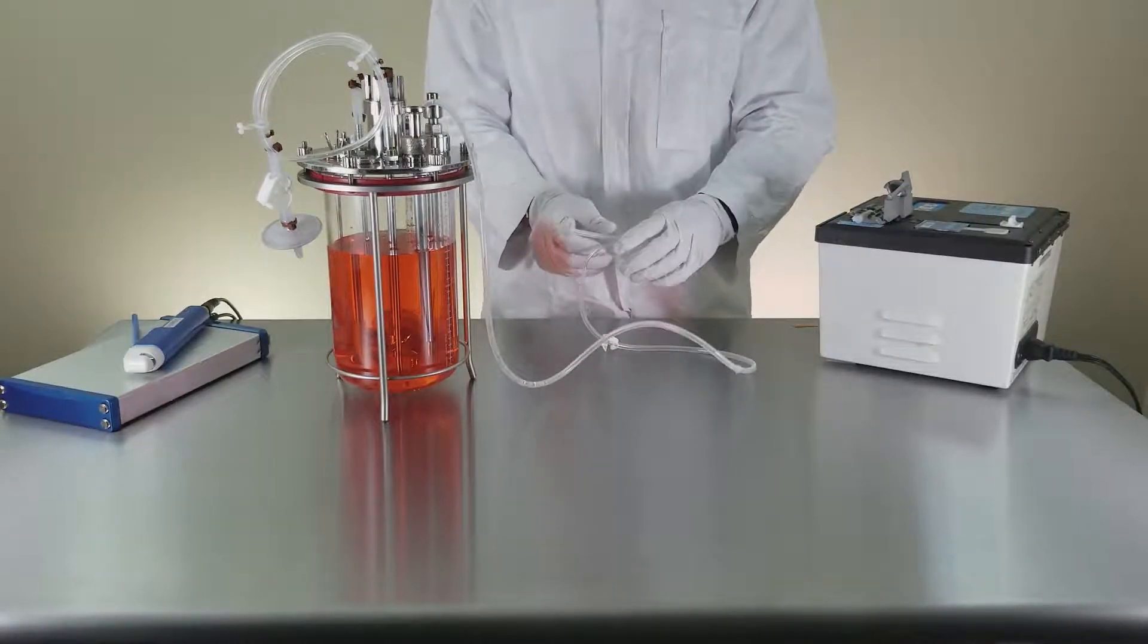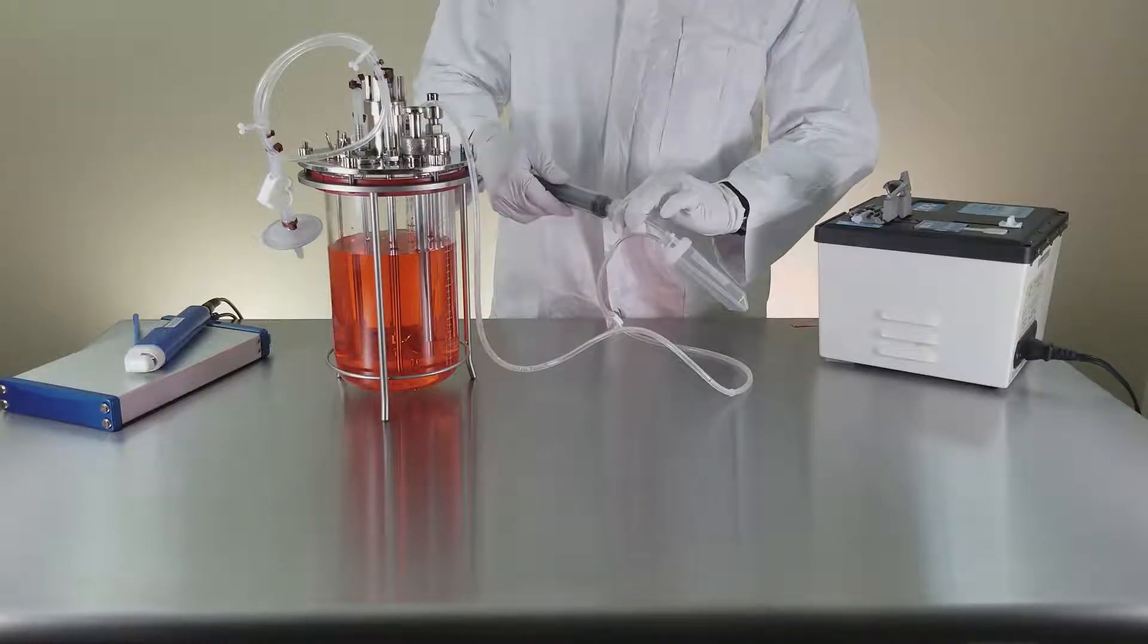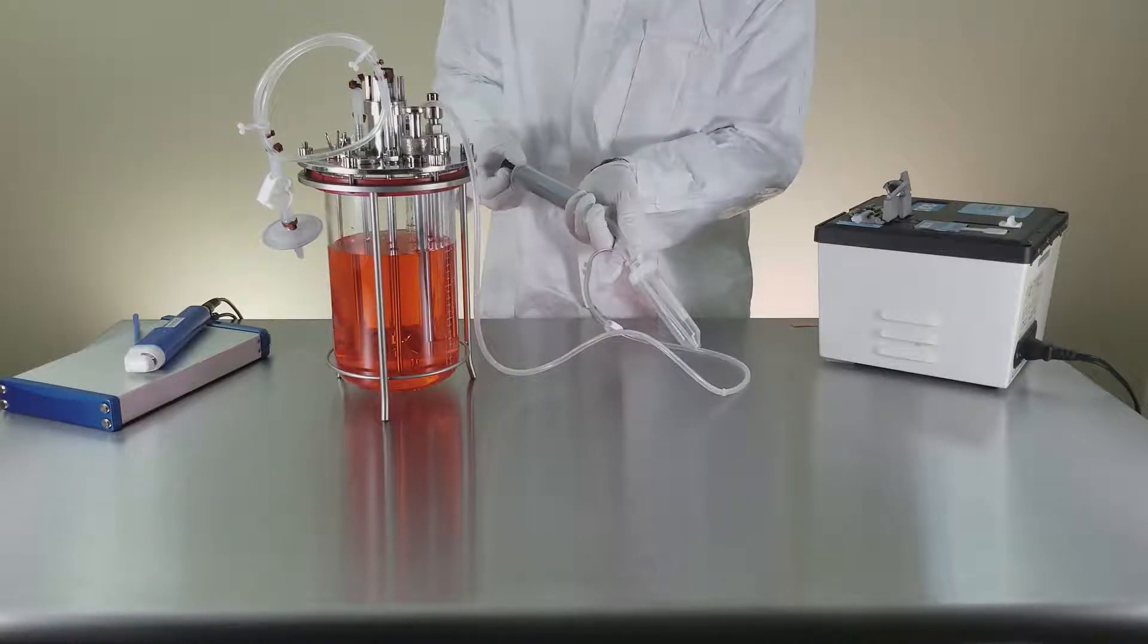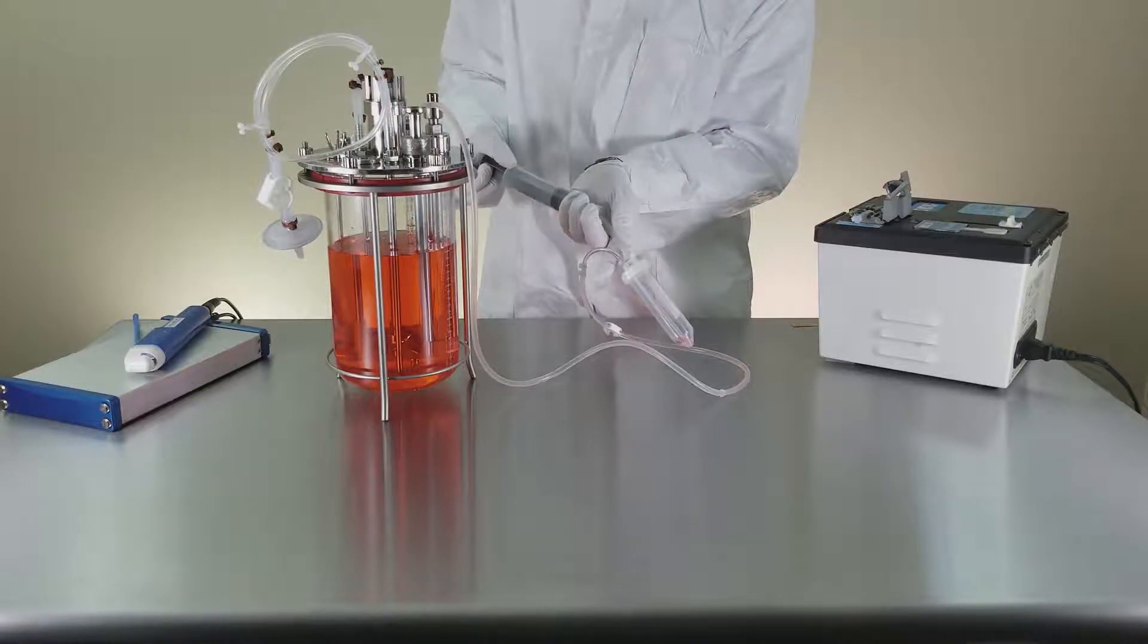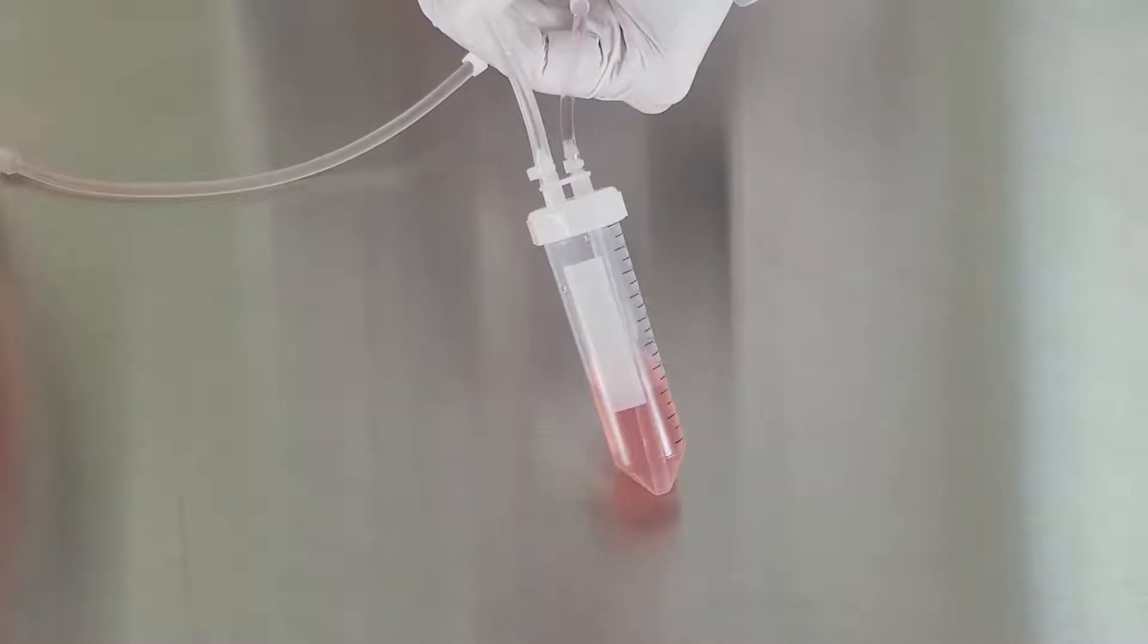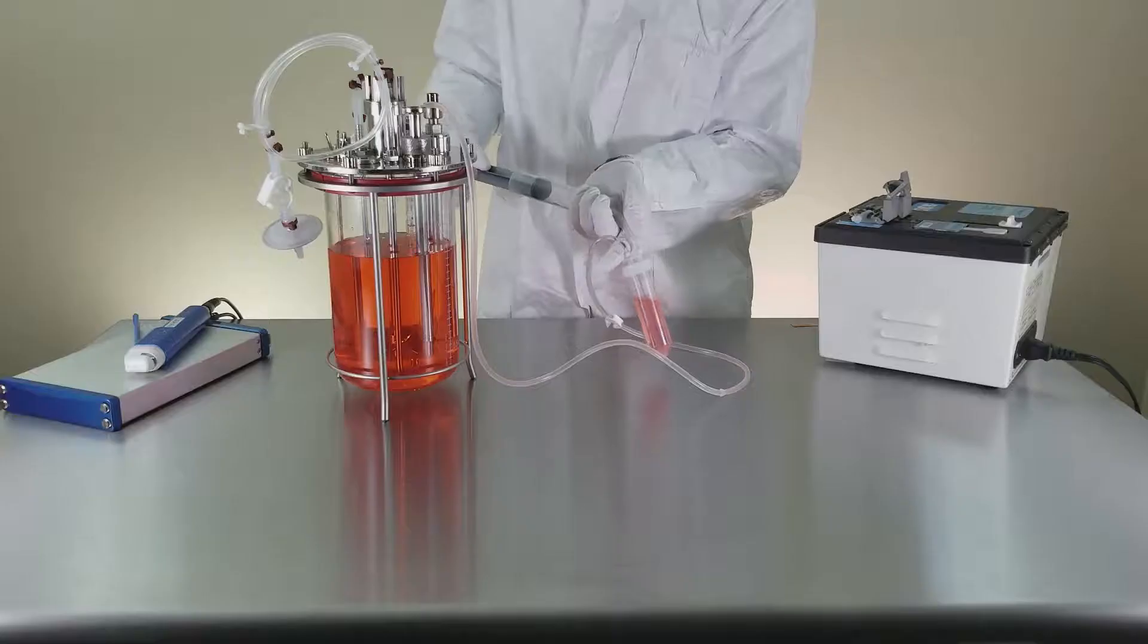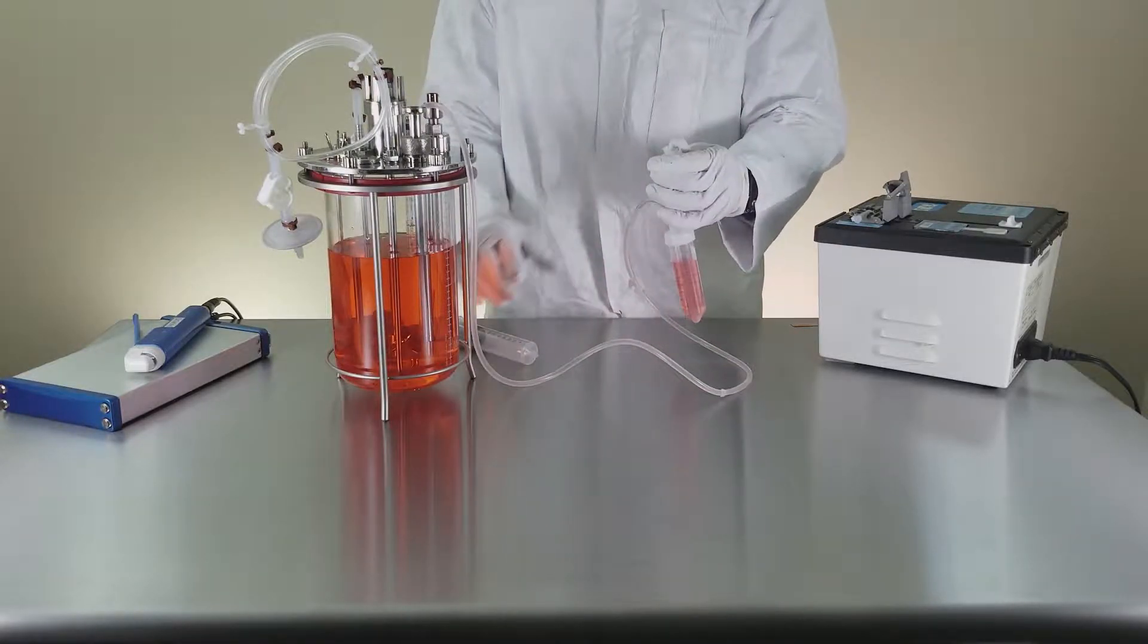To take a sample from your bioreactor, connect a simple non-sterile syringe to the sterilizing grade filter on the Omnitop. By simply pulling back on the syringe, you'll create a small vacuum inside the Omnitop that will draw your sample from the bioreactor into the tube. You can now disconnect your syringe from the filter.